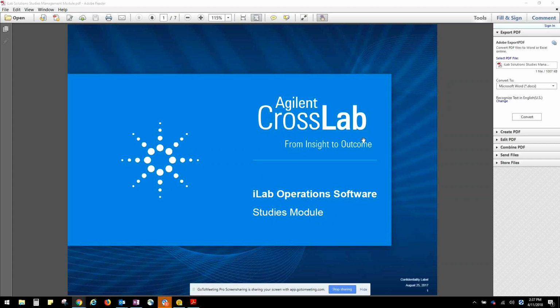So the studies module can be a bit confusing because it is an auxiliary layer above and beyond our service and project-based functionality that exists in that base suite. When you think about studies, think of it as allowing a core to have a layer above and beyond service requests and events. It allows for tracking individual activity across a project that typically expands over time. It's kind of like an onion, an additional layer that Ilab offers you here.